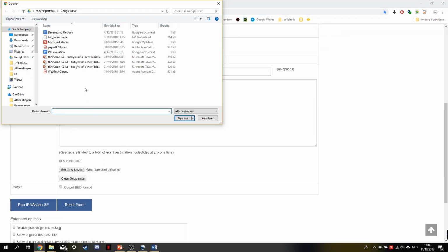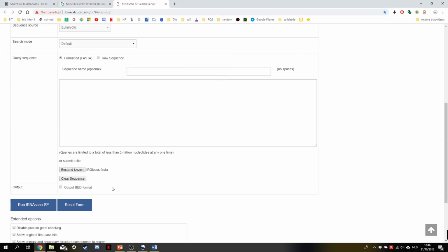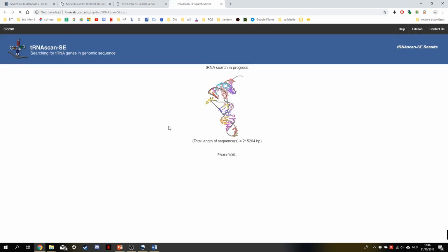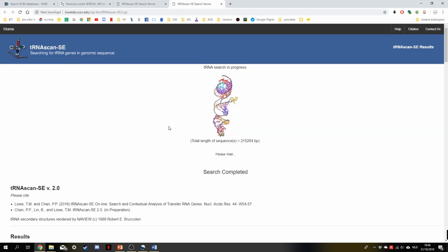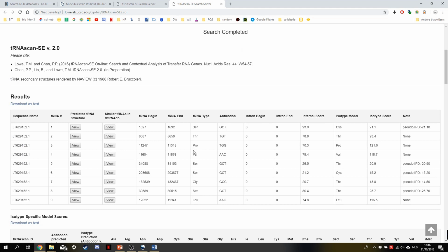So we upload our file, which is here, and then we click on output. So these are the results.